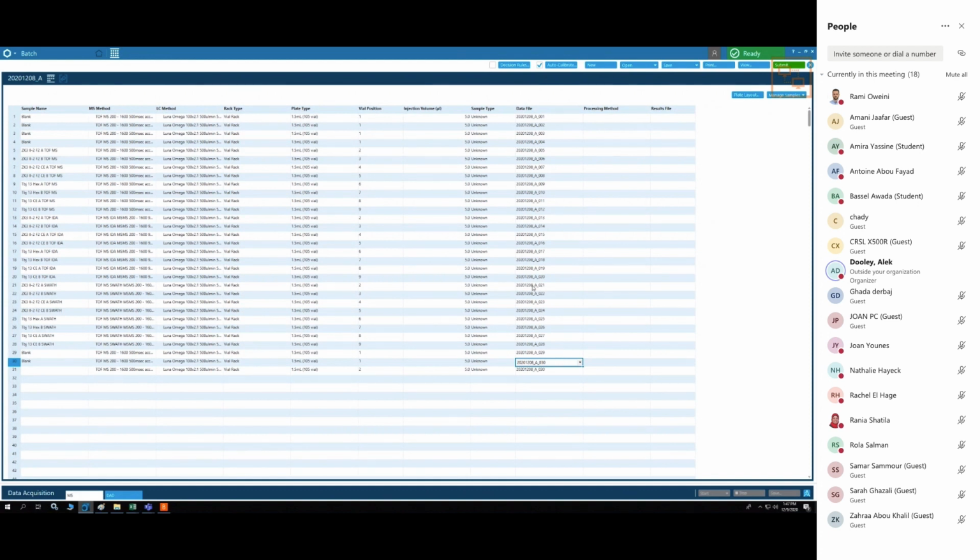Any questions from yesterday? Because I know we went through this very fast. At least the good thing is that you will never risk overwriting. You may make a mess and put multiple files into the same data file, but you will never lose data by overwriting. So you have that comfort.